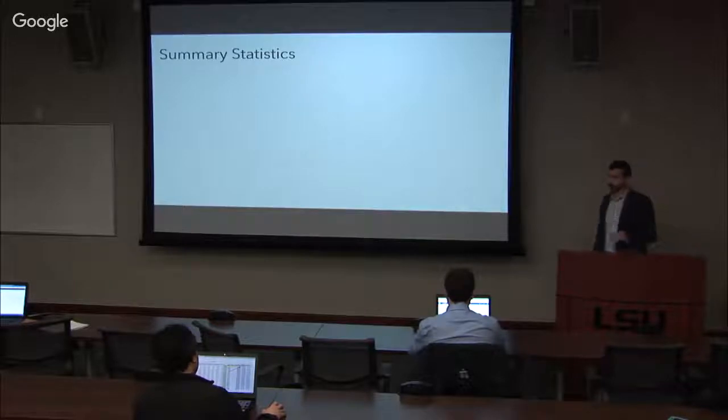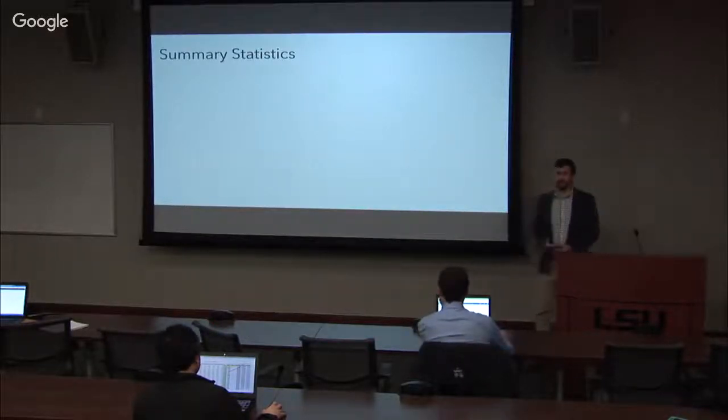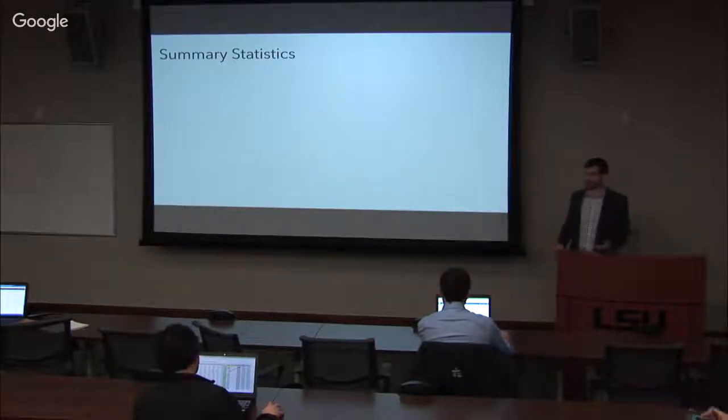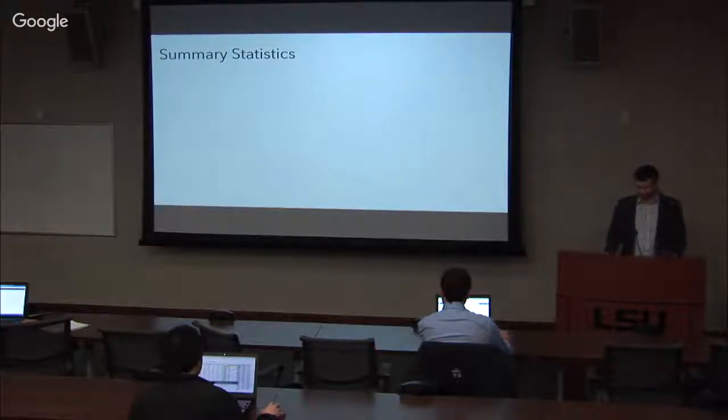But to do a more in-depth analysis of this, you have to look at a few other parameters. It's not enough to just do logarithmic scale and assume every time this is going to be exactly correct. And there's a few things that we're going to discover here about the quality of data as we do some summary statistics.